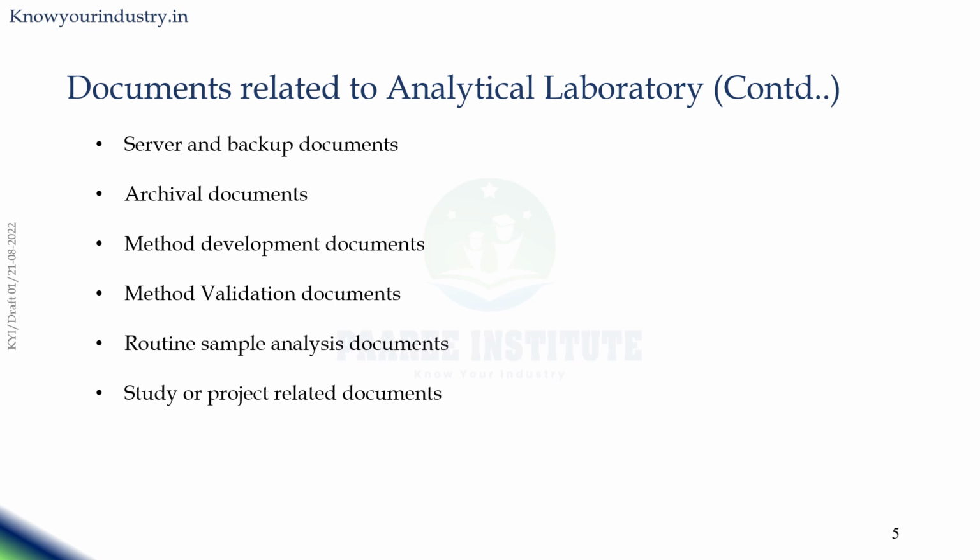There are some more documents which are related to the analytical laboratory, which include server and backup documents, archival documents. Those documents which we have completed and are being stored for a longer period of time are called archival documents. Then method development documents, method validation documents, routine sample analysis documents, and study or project related documents. These are all the documents which are available in the analytical laboratory.